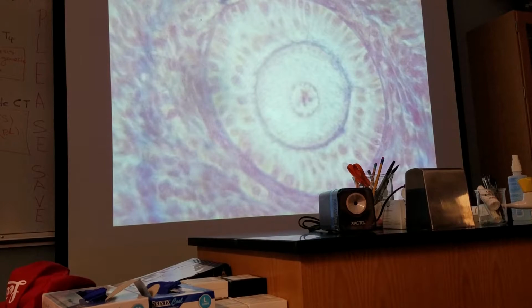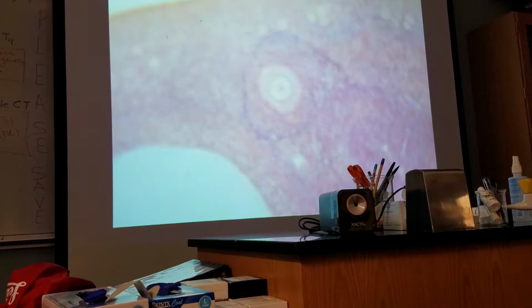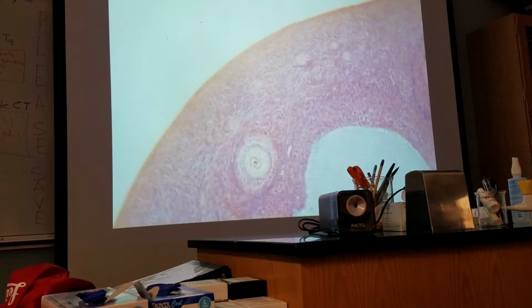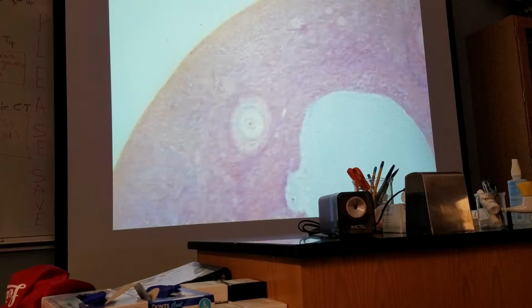I will take you to another primary follicle that I have seen, but I have to go and find it first with the low magnification. Oh, this one. This is a little larger than the previous one.